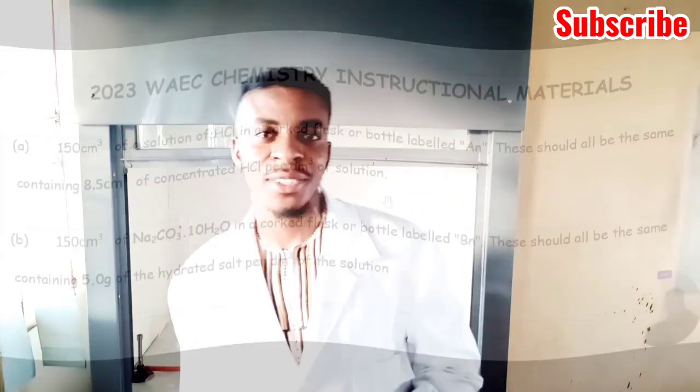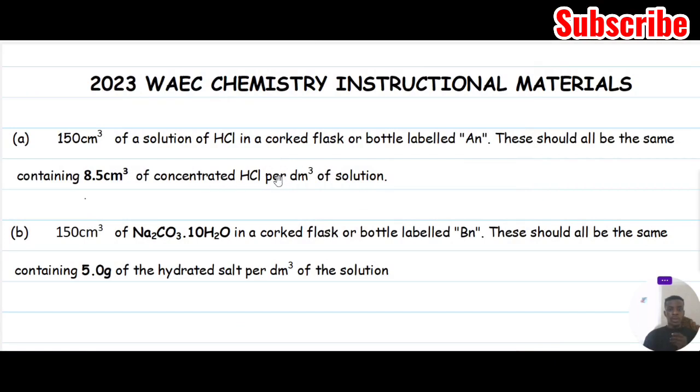Alright, we'll start with the preparation of the standard solution from the instructional materials. As you can see here, this is the 2023 WAEC chemistry instructional materials. These are the information in your instructional materials. The A part of it says you should have 150 cm cube of a solution of HCl in a corked flask or bottle labeled AN, containing 8.5 cm cube of concentrated HCl per dm cube.